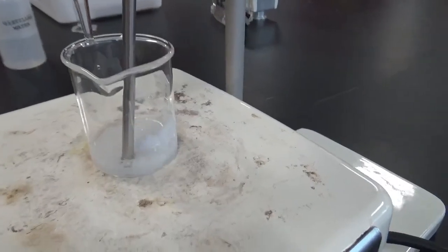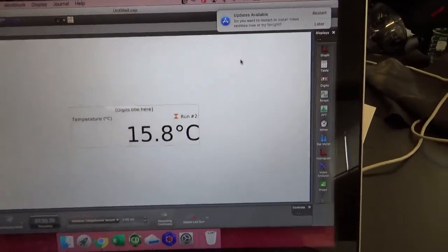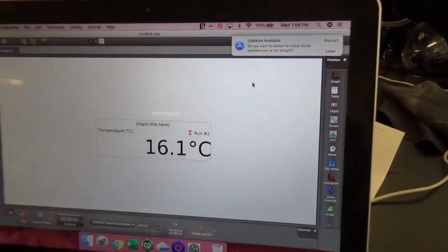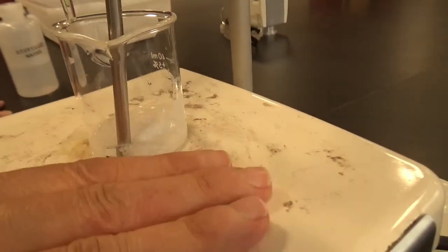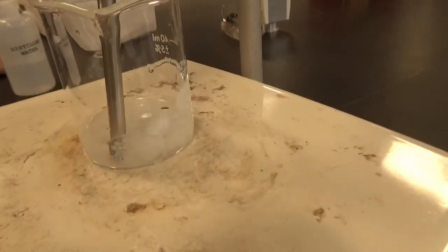Let's see what the temperature did. Feel it. It's actually warm. It's actually too hot. Oh wow, it's very warm. Okay, this is going to go above. See, I burn food sometimes on my stove. So, you can't see much. It's just stirring, but can you feel the heat? Yeah, can you feel the heat? This is feel-o-vision.